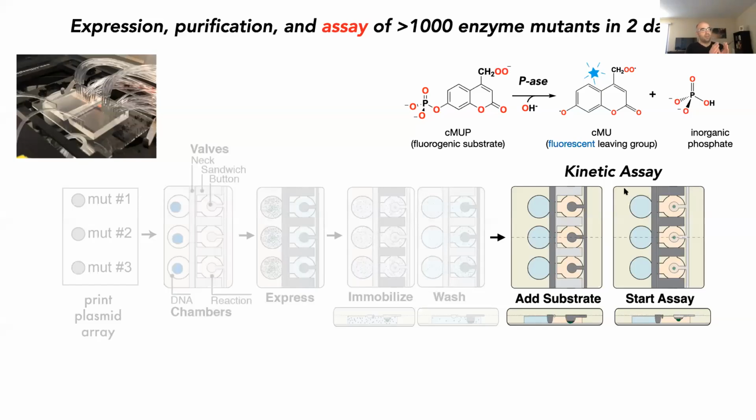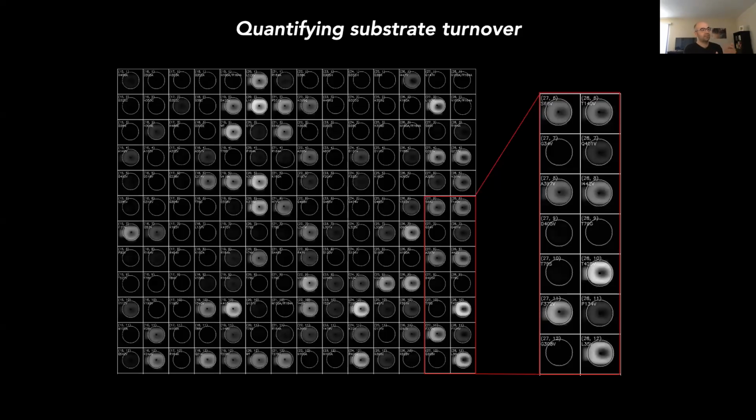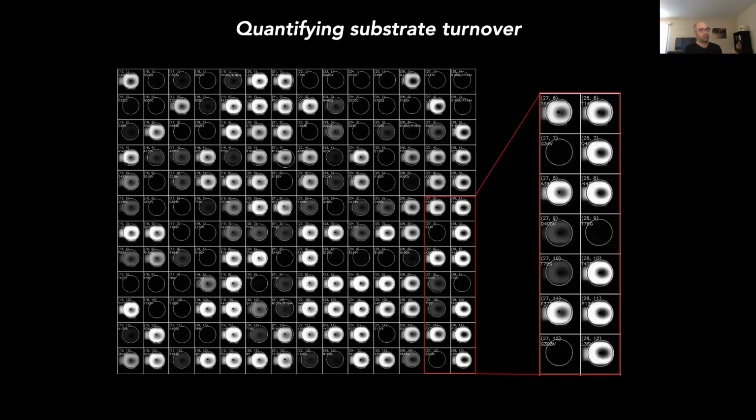So the button valves, the valves in which our enzymes are surface immobilized, allow us to start and stop reactions as well. So to run kinetic assays, we simply close the valves, protect our enzyme and remove it from solution, and then introduce the substrate. So we just flow through, equilibrate the chip in one substrate concentration, and then we open the valves, expose the enzyme to that solution, and the reaction begins. And our substrate is fluorogenic, meaning that when the enzyme reacts with it, we generate a fluorophore. So to get kinetics, we simply track the buildup of fluorescence over time.